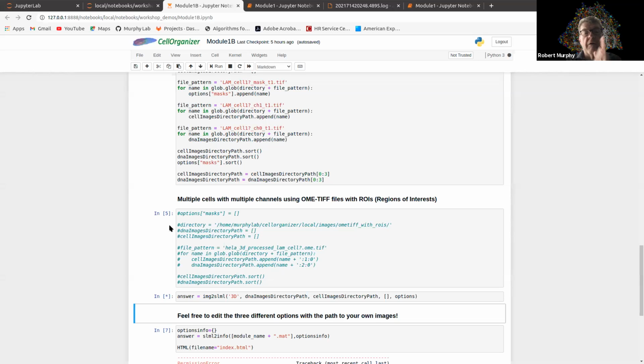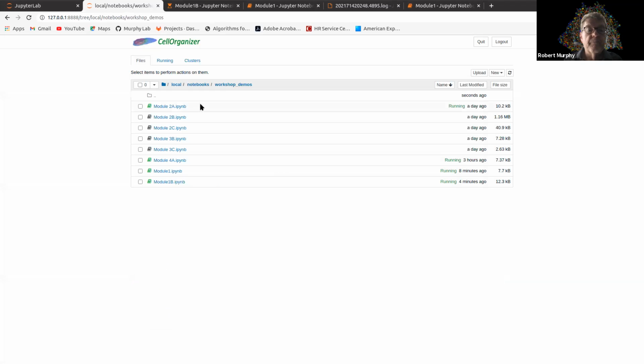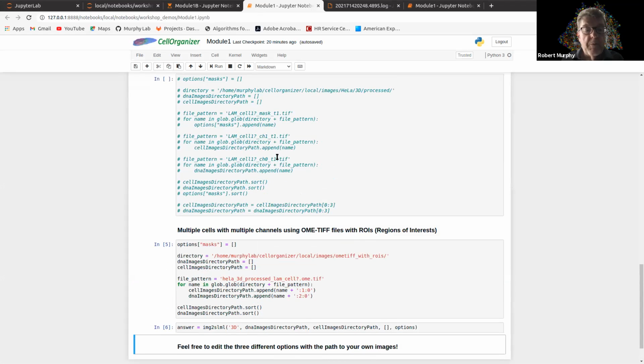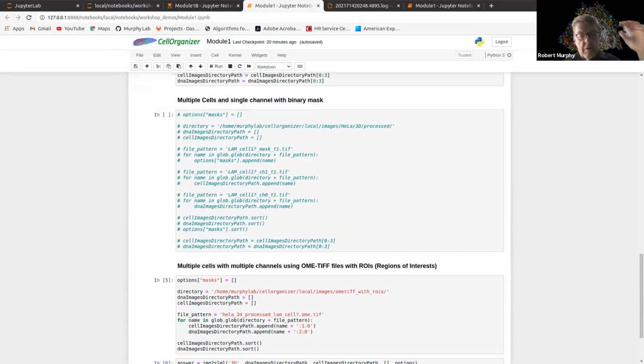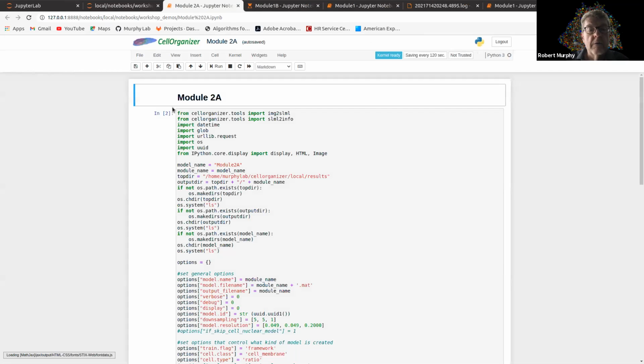Then let's talk about, well, first, if there are any questions on anything we covered so far. And I hope that at least some of you are trying some of these things on your own. So if questions come up, you can ask us. But maybe what we can do now is to talk about module 2. And I think we can start there. And so here, once again, same story.